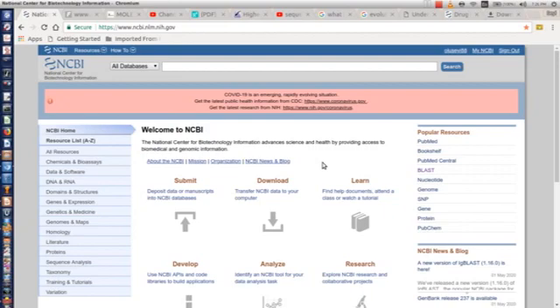So what we need to do is sequence the coronavirus in Nigeria, and then use that sequence to run a multiple sequence alignment, and then we look for variations. You can even build a tree to understand which coronavirus is highly related to the one in Nigeria, because at some point, as the coronavirus begins to infect one patient or the other, variations arise, mutations arise, and features of the coronavirus can at times even mutate to an advanced coronavirus.